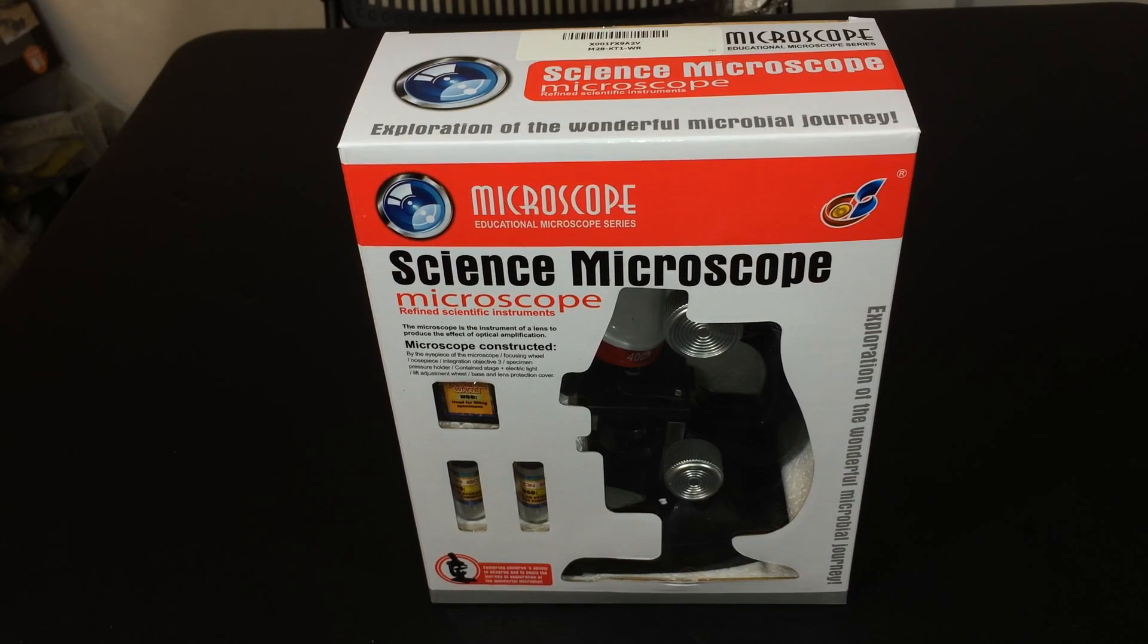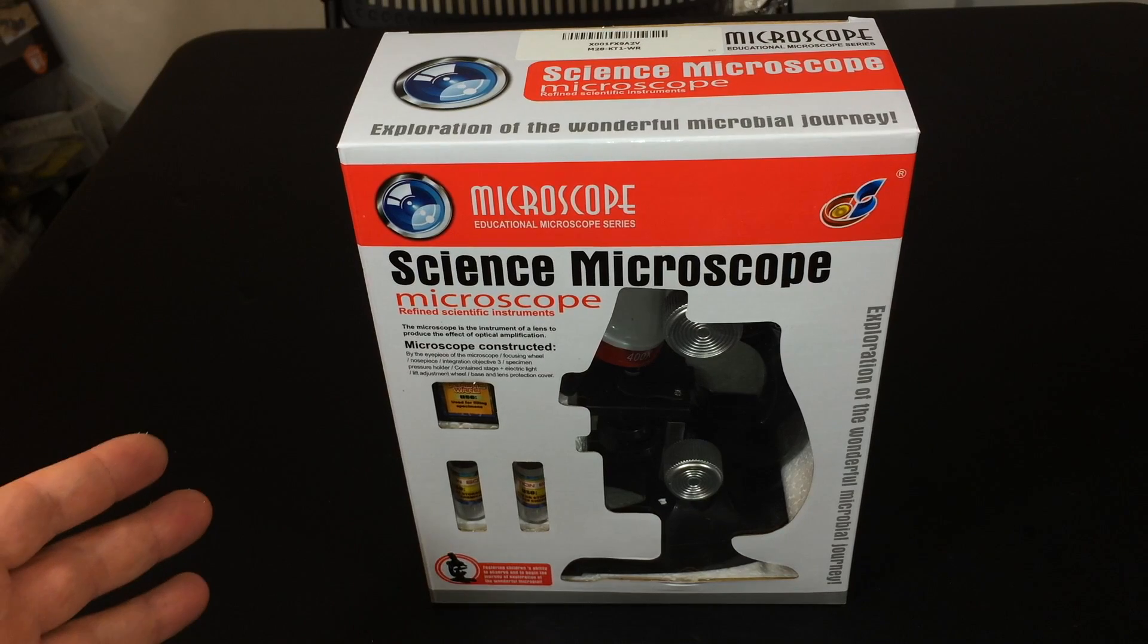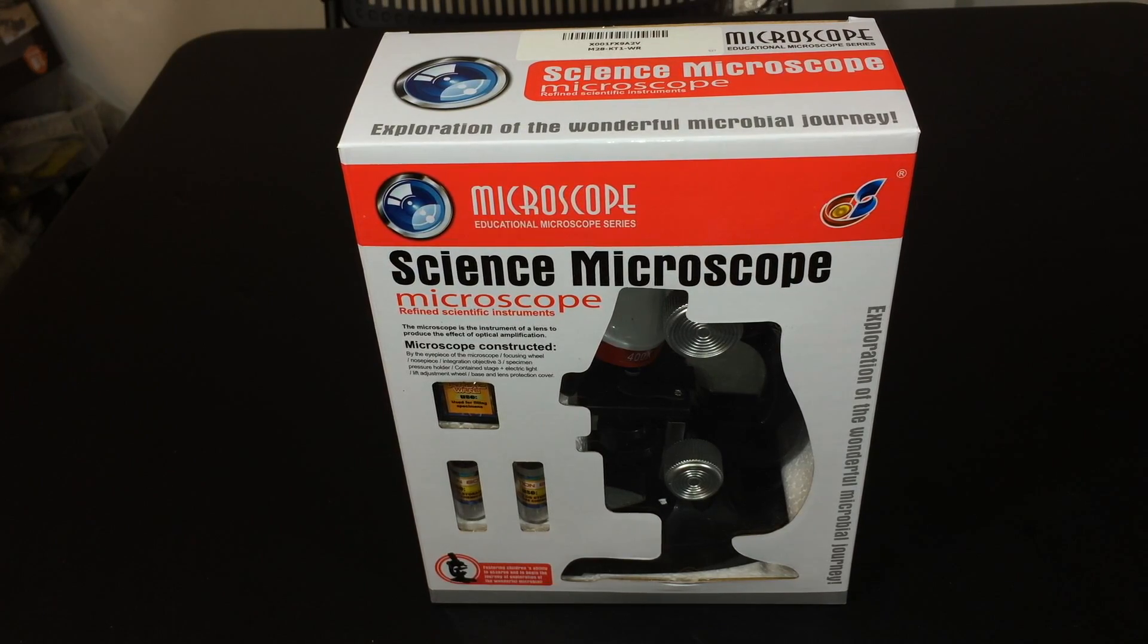Hey guys, welcome back. Today I'm bringing to you another cheap purchase from Amazon. This is a children's microscope. I've actually always liked chemistry in school when I took it and I always wanted a microscope of my own.